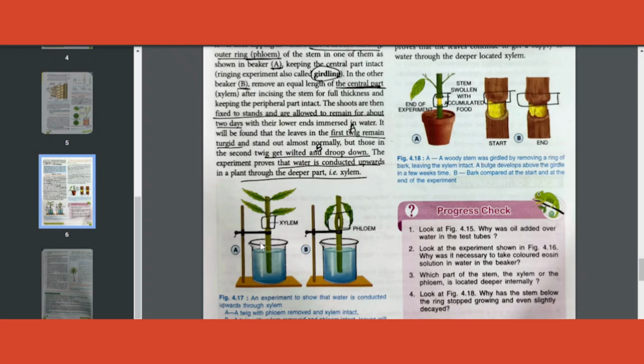In the first one, you cut out the surrounding area of the stem. The central part you don't cut. Instead, you are etching out the side part of the stem. You keep on doing it till you get only the center part, and the rest of the stem remains the same. So the stem is there, only one selected area, you're carving out the outside part, and you go on carving till only the core is left.